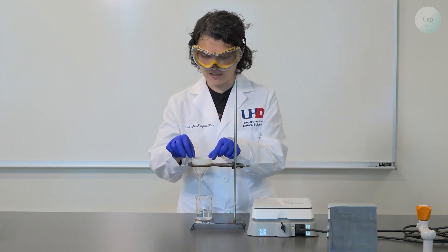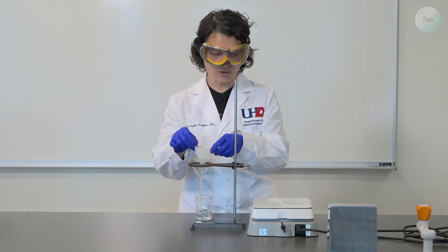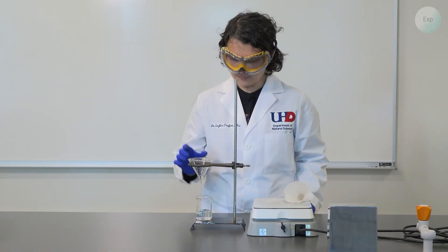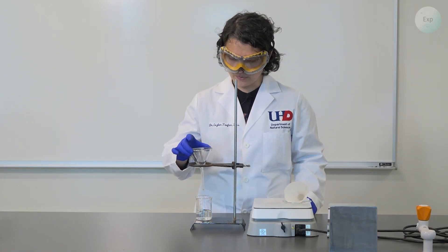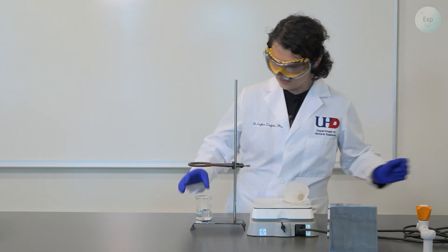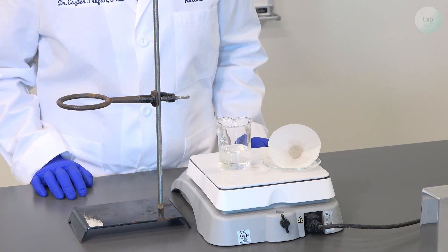So very gently, using your fingers, because this is just wet paper, you can extract it from the funnel and place it on the watch glass. Next, you can remove your funnel, set it aside, place it on the hot plate, and wait until all the water evaporates from it.